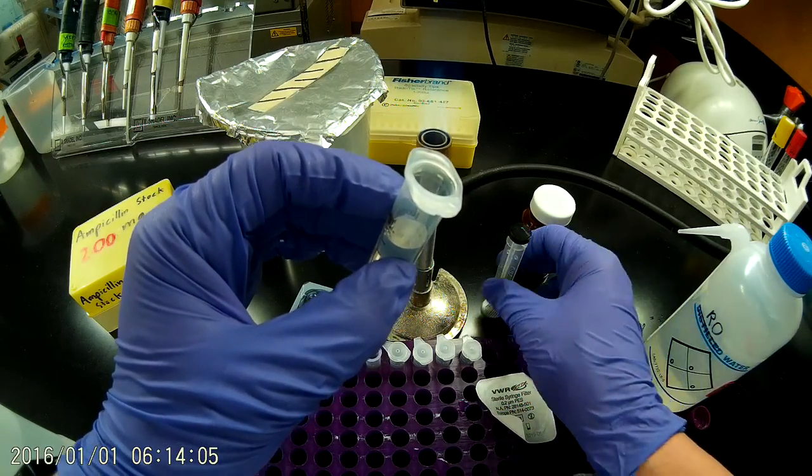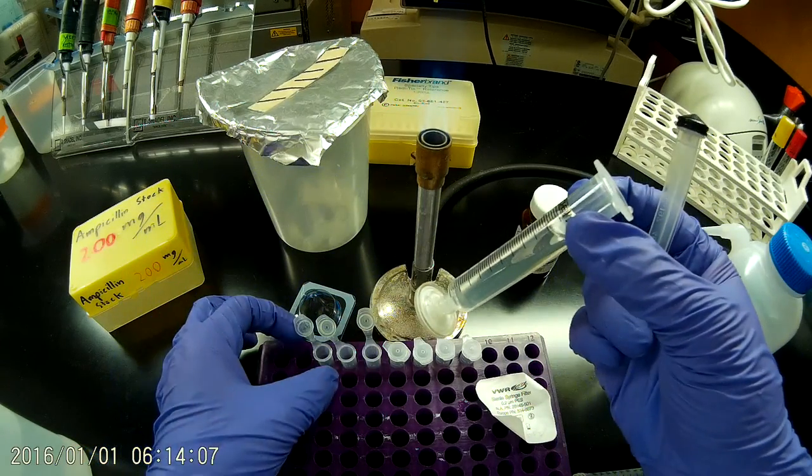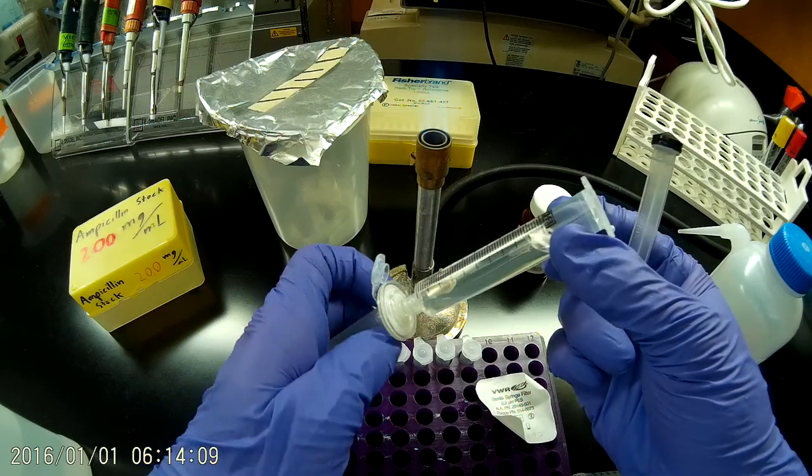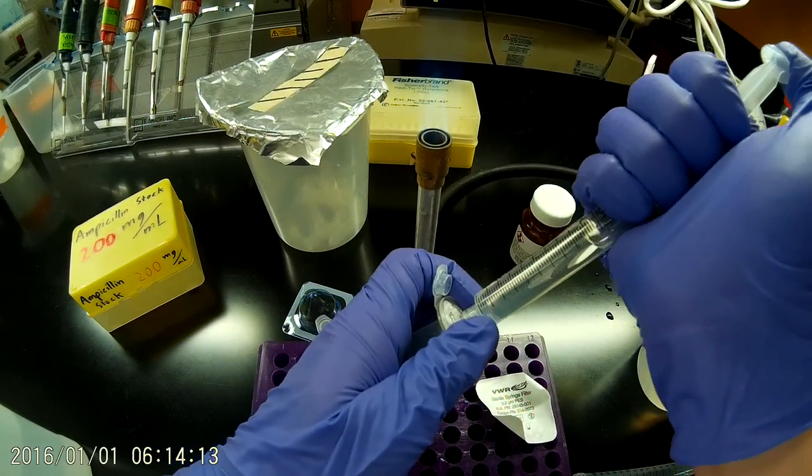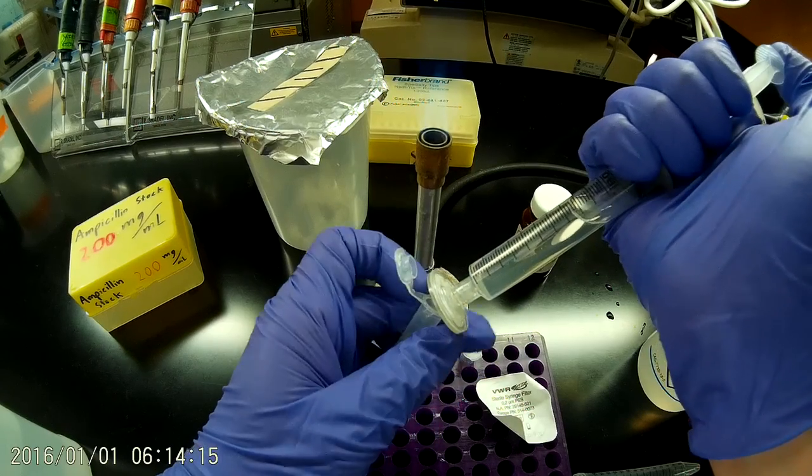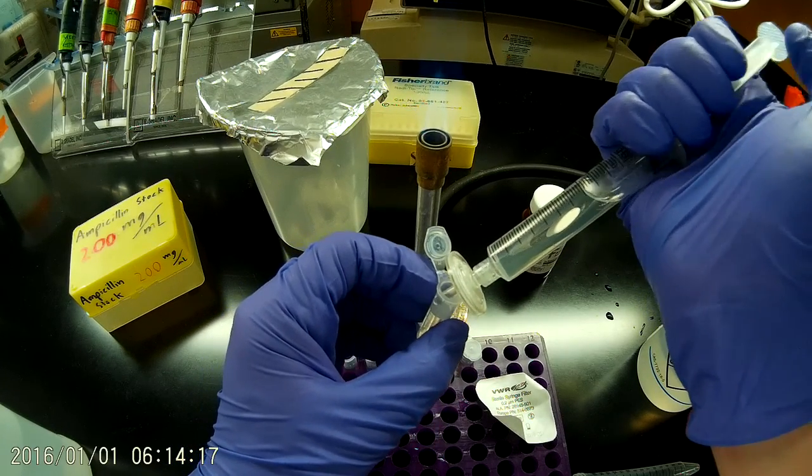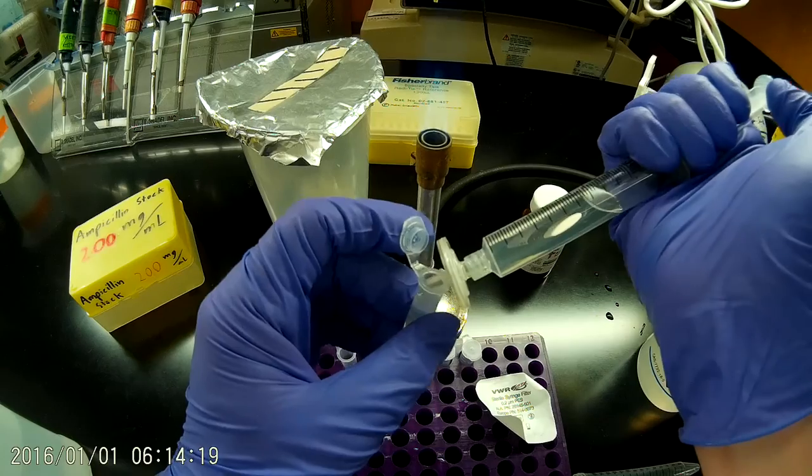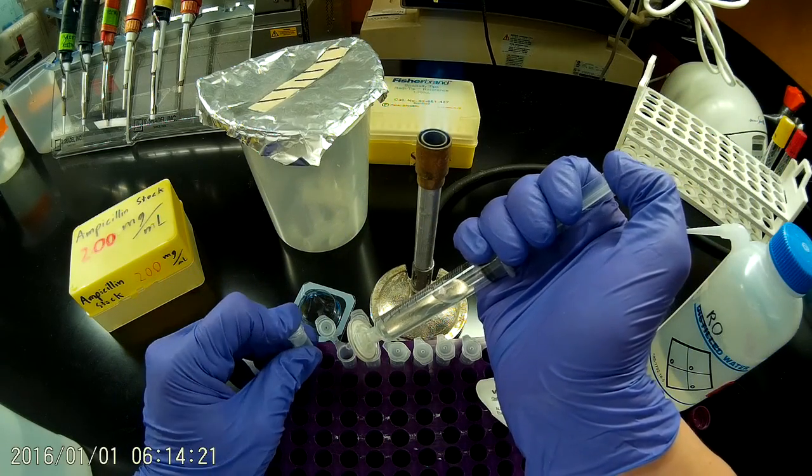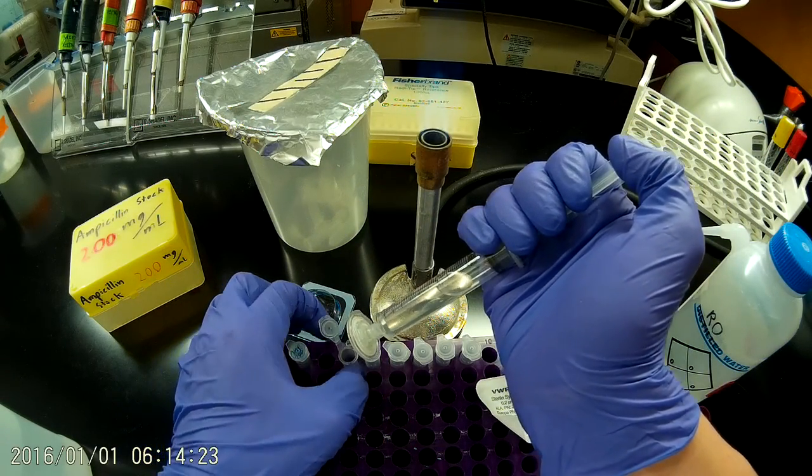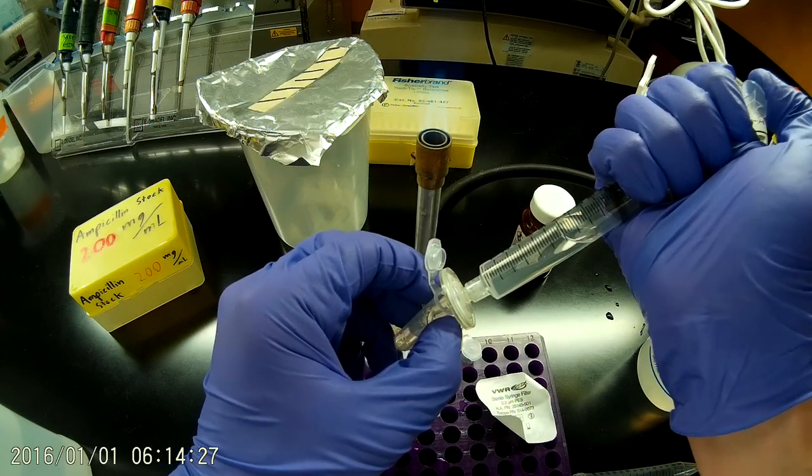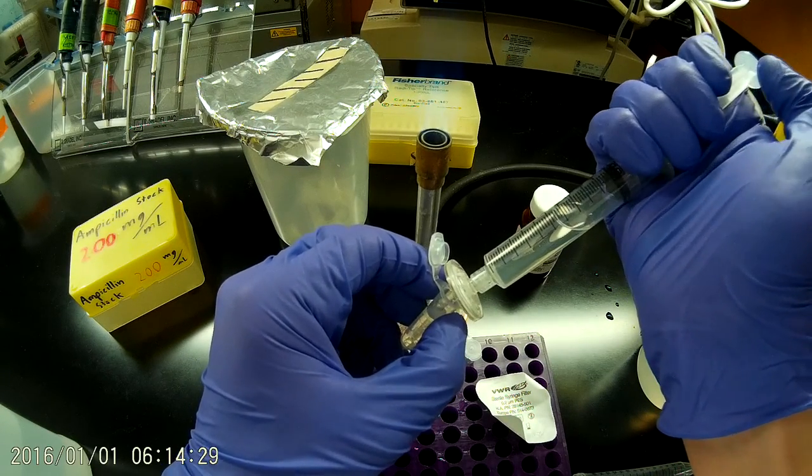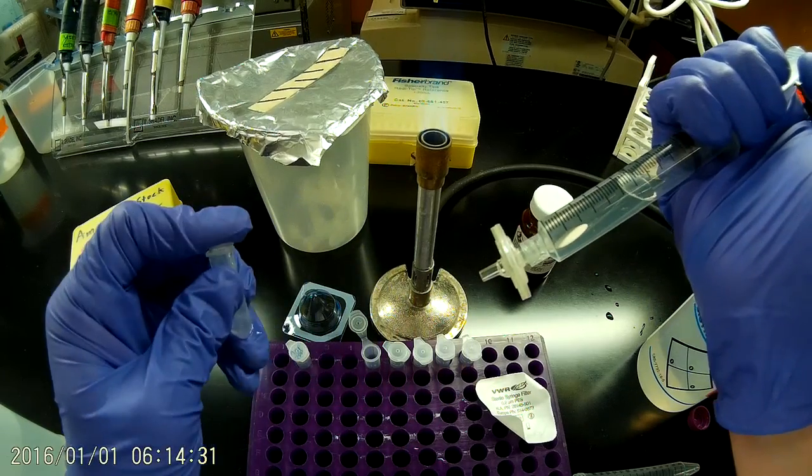I'm going to hold the end of this in one of these tubes while I insert the plunger. I'll fill each one of these tubes with about 1.5 or so mils of the ampicillin stock. That way when they freeze they have some room to expand.